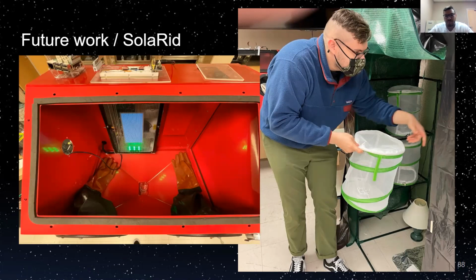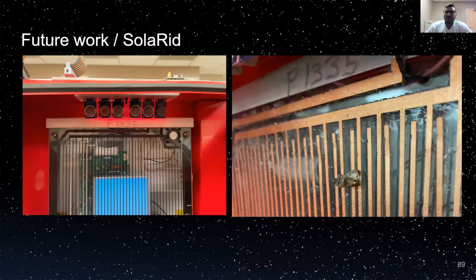But you can see here we're doing a chemical trial in the base of this glove box to make sure that we can measure the VOCs still. And on the right, here's me handling some moth larvae. So again, the theory is, is it possible to analyze VOCs and identify specific insects? Currently, the only insects being tested are moths. And you can see here again the gas array on the top, and on the right here is a moth that has been successfully killed on the grid.